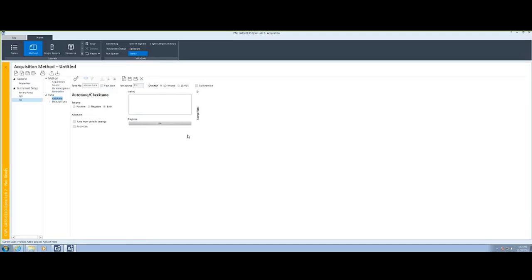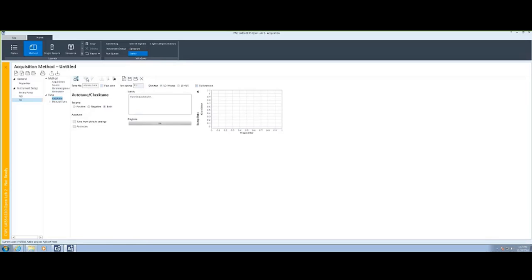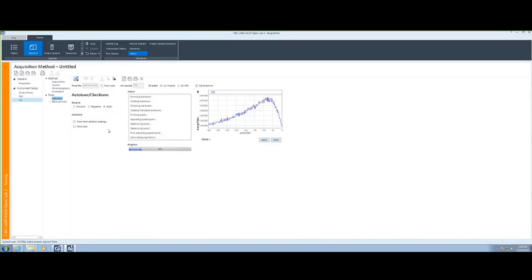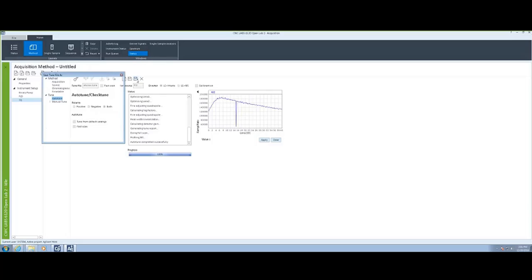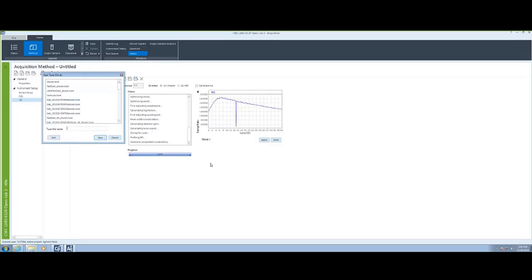In addition to the auto-tune files that are supplied, you have an ability to do your own auto-tune by selecting the auto-tune and allowing it to go through its tuning functions. Once the tune is complete, you can save the tune parameters to a new file and give it a unique name.